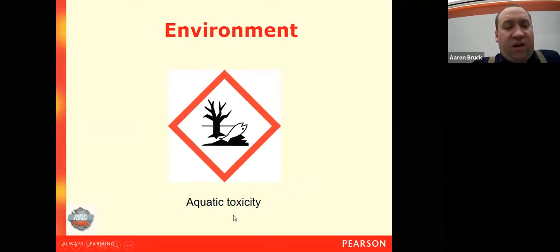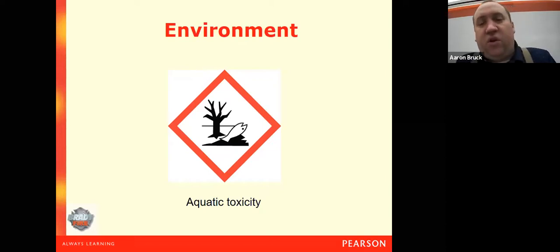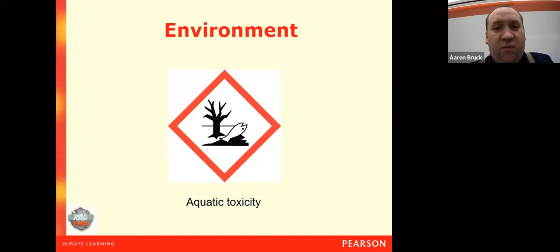Here's an example of an environmental toxin. Again, environmental pictograms are not required for use in the United States. I'm showing it here merely just to make you aware, especially if you work with anything that comes from foreign manufacturers. You might see this.